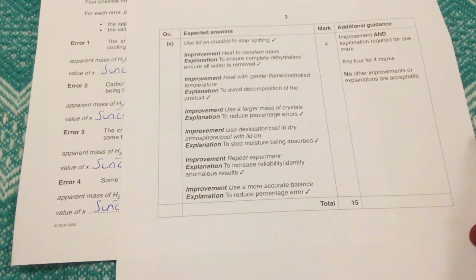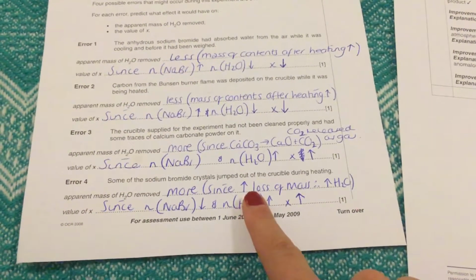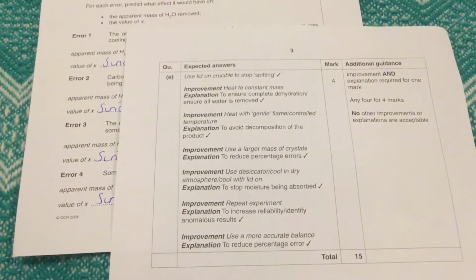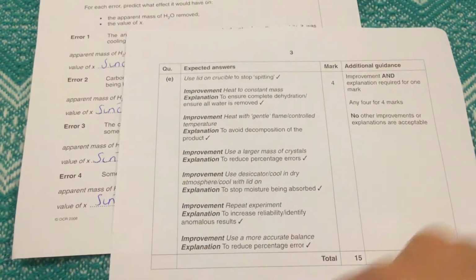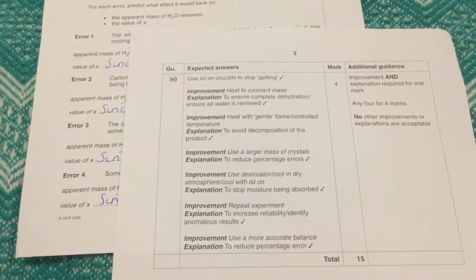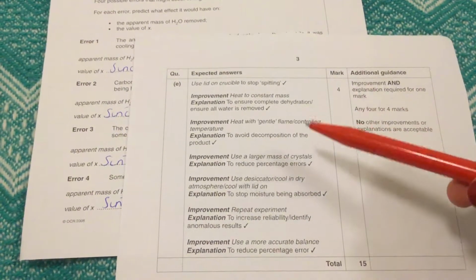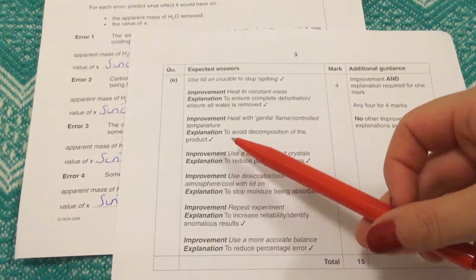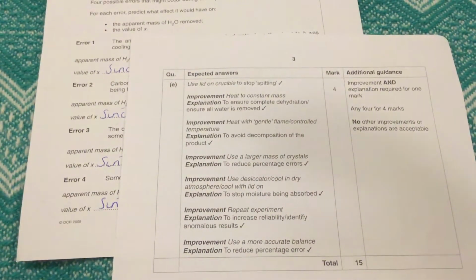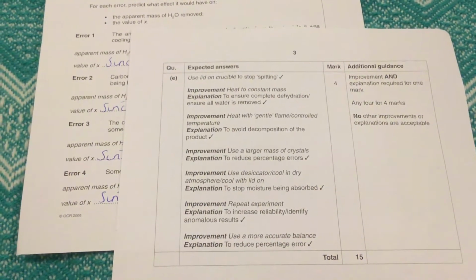So we've got improvement number 1, which is to use a lid to stop spitting, and that would connect into this one here. So if we've got a lid, they can't jump out. Improvement number 2, heat to a constant mass to ensure complete dehydration and to ensure that all water has been removed, because there is a possibility that some water might not have been removed. The next one, heat with a gentle flame or a controlled temperature. Now this would avoid decomposition of the product because it is possible that anything that you are heating can decompose thermally if you apply enough heat.